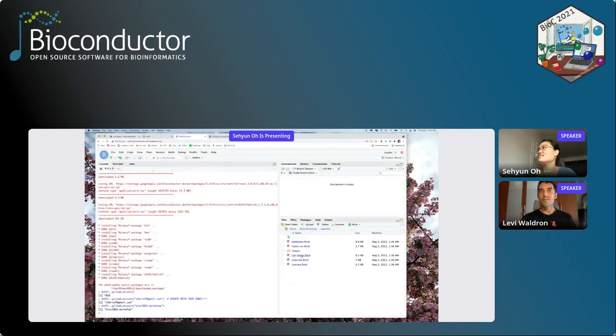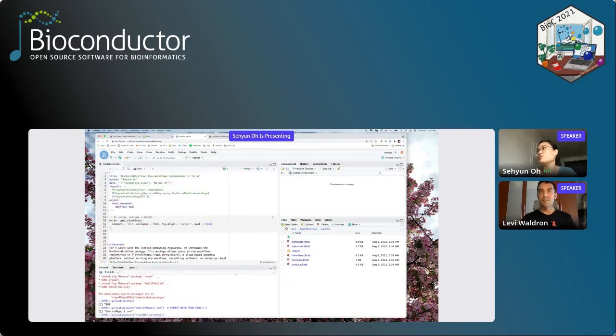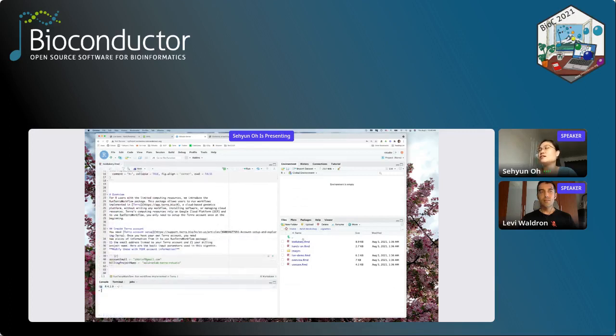Okay, that's useful. So this Orchestra represents your local machine, and then if I go to the BioBakery, that's one of the use cases I was mentioning earlier, which uses Terra and Google Cloud resources remotely.